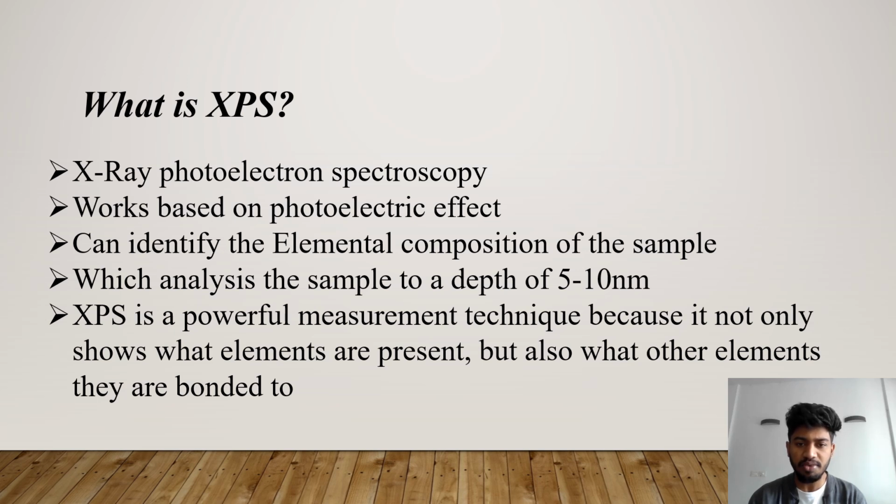XPS is a powerful measurement technique because it not only shows what elements are present but also what other elements they are bonded to. This is something unique about this XPS spectroscopy.